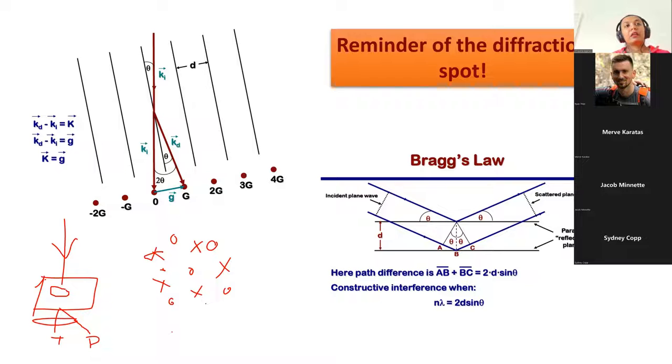So my point is your microscope, which has a very high resolution, is able to pass your electron light through whatever comes on its way. So you can have multiple diffraction patterns and you will have to separate them by either tilting or by going to the edges where you have less oxidation present, and then comparing it. And then you can definitely play with the spot intensity in the Gatan microscopy software, and you can literally eliminate these spots and try to measure the D corresponding to the main plane. You can also measure if it is oxidation or maybe some other impurity on the sample.